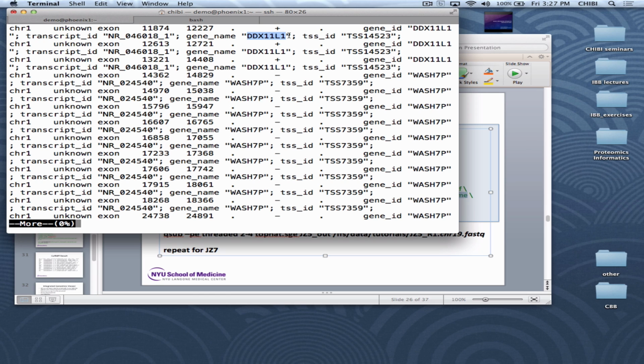These files are here, but if they're really not giving you what you want, you can come up with your own genome version, index it yourself, with your own annotation that corresponds to that genome. Keep it present in your working directory and point to that instead of our reference. This is particularly important for messy genomes that are not like the big three of human, mouse, and Drosophila, where different versions may exist from different lab groups or different databases, and you may not love the Illumina UCSC version of your genome.